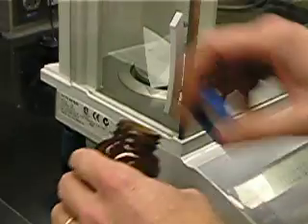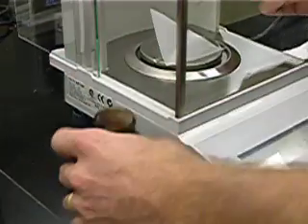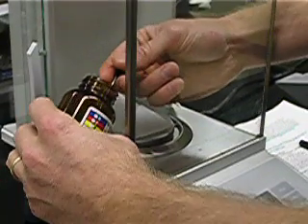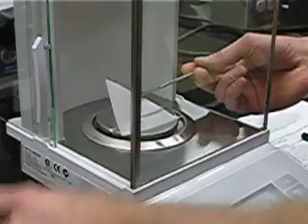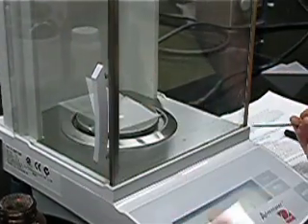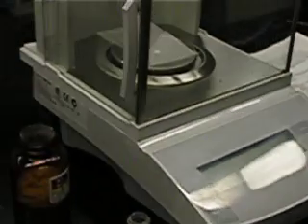Now, I'm adding just a small amount of solid to know how much more I need to add to get to 0.05 grams. I then close the side draft shield, and I have 0.005. It's just that bit of solid, so I need approximately 10 times this amount to obtain 0.05 grams.